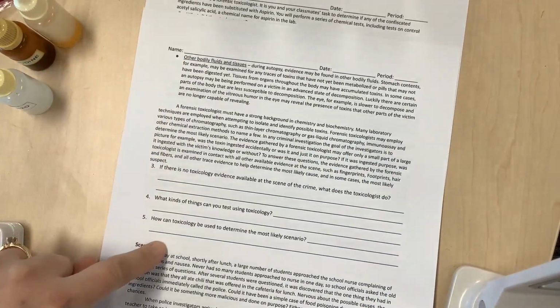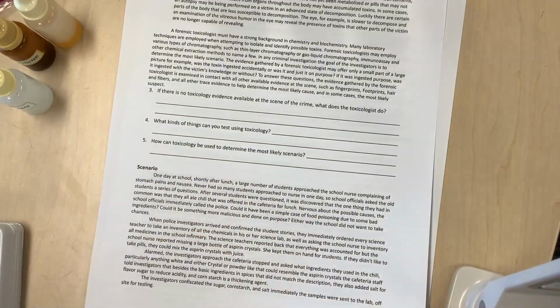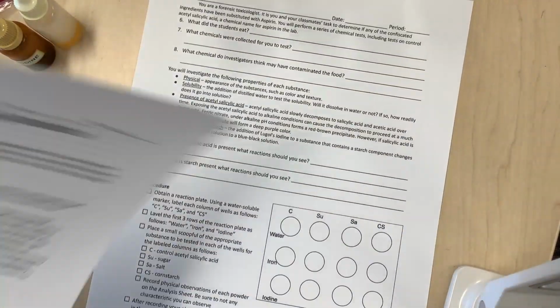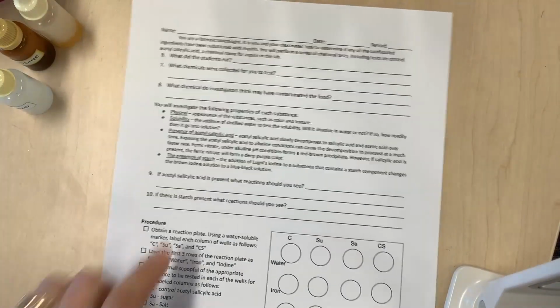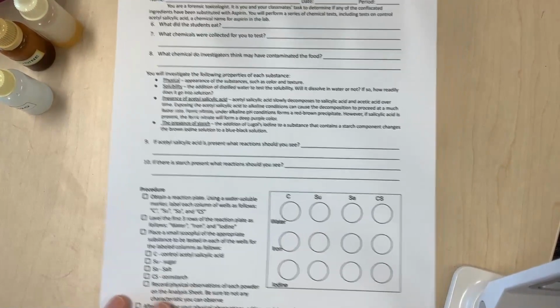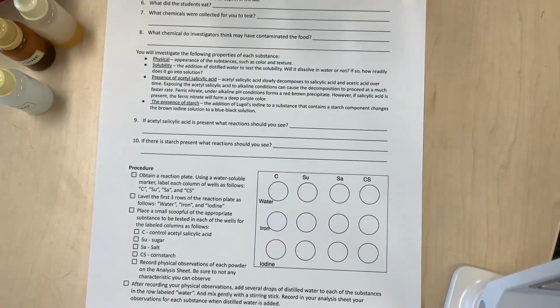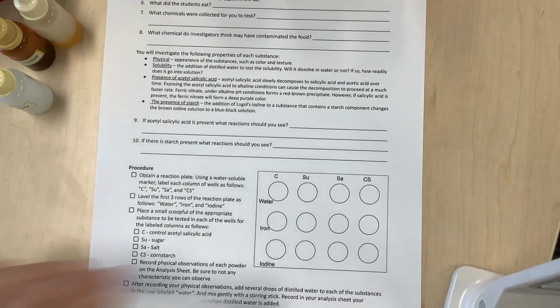More questions here on the back, and then it gives you the scenario, which is basically that they believe food has been contaminated with aspirin crystals, which you answer some questions about, the scenario and what's supposed to happen, and then you're going to set up your reaction tray. You only need one tray for this one.